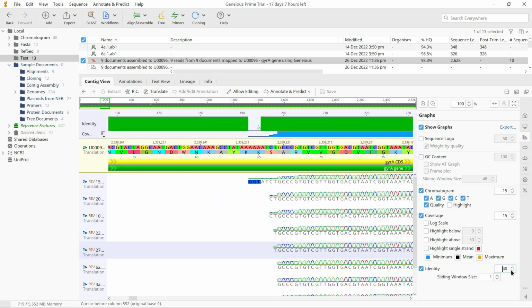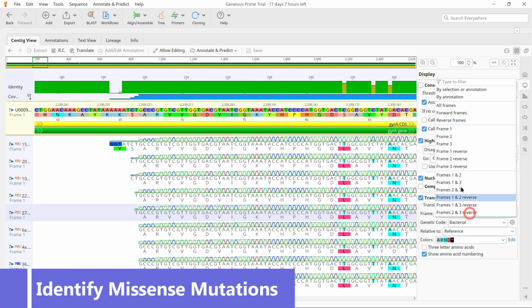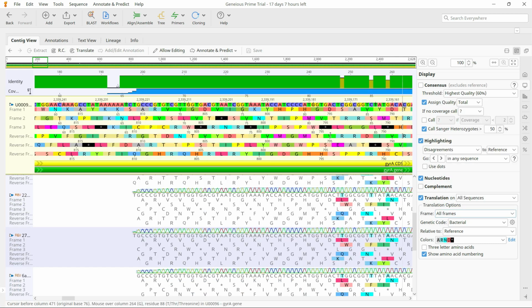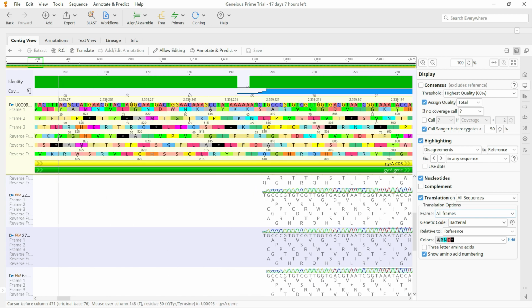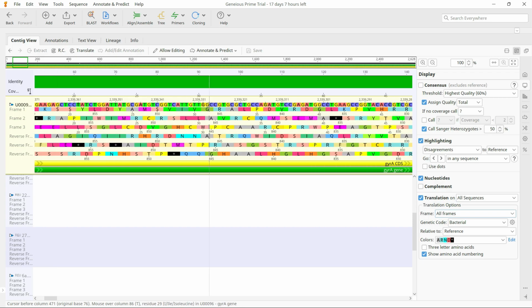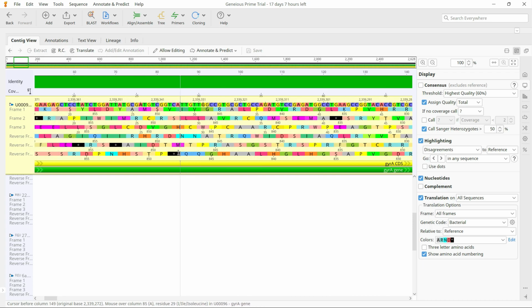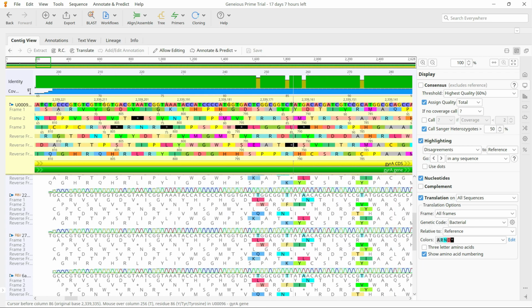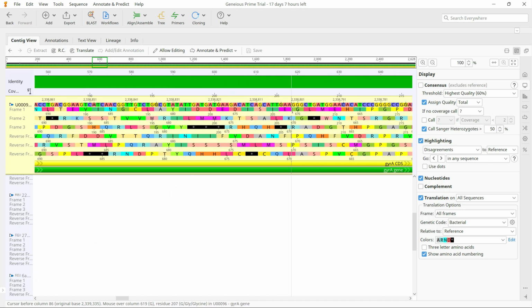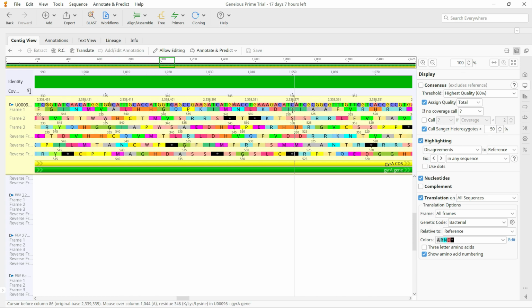Some are silent and do not alter the amino acid in the final protein. To detect these, we have to translate the sequences with a suitable reading frame. As we already know, a sequence can be read in 6 different reading frames and nature uses only one at a time in most situations. For an annotated gene sequence like we have extracted, reading frame 1 works just fine relative to the consensus or the reference sequence, but in other cases you need to check each of the 6 frames to select the one that has no internal stop codon.